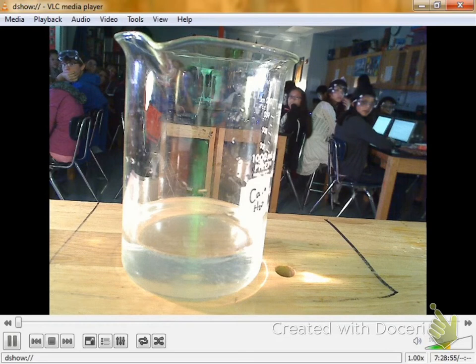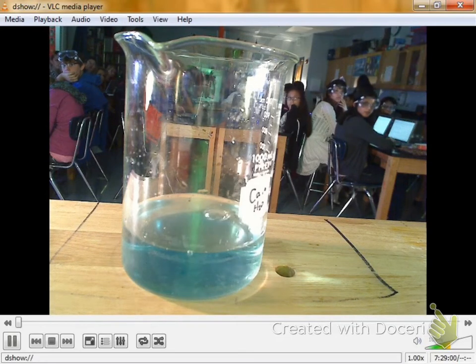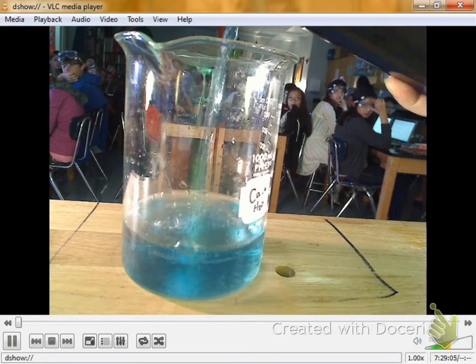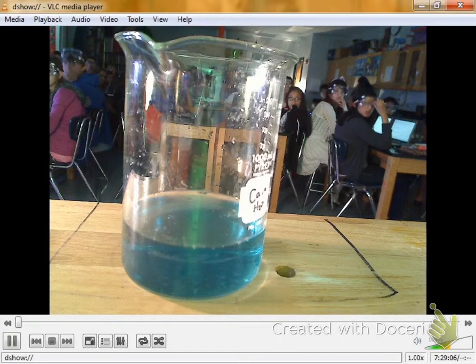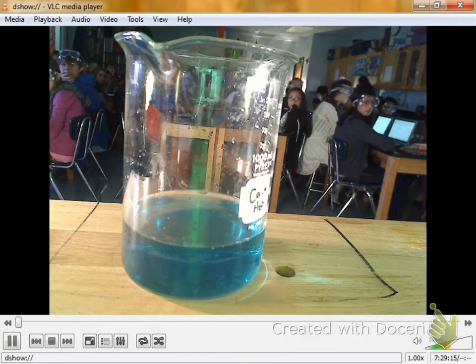Alright, so my calcium beaker, I'm going to get ready. I'm going to put a little more cabbage juice in here again. Make my water all nice and pretty blue. Make it nice blue. Don't make it too blue because then we can't see the metals in it. Alright, so I'm going to take a piece of calcium. And I'll drop calcium in the water.